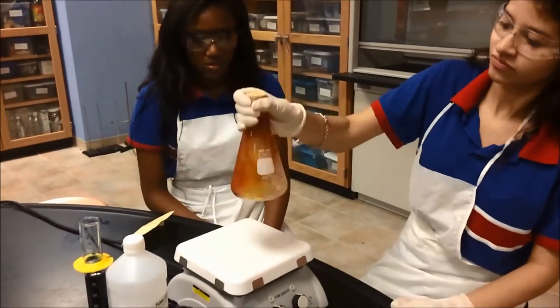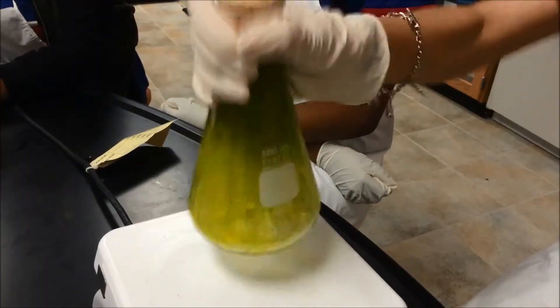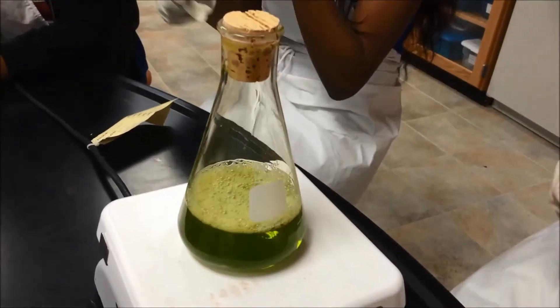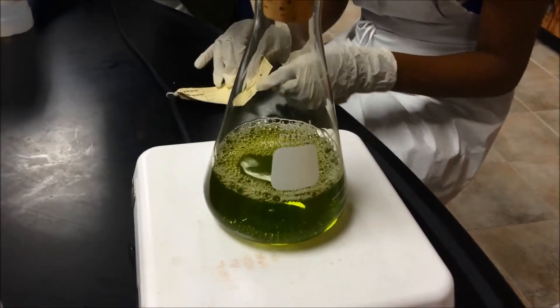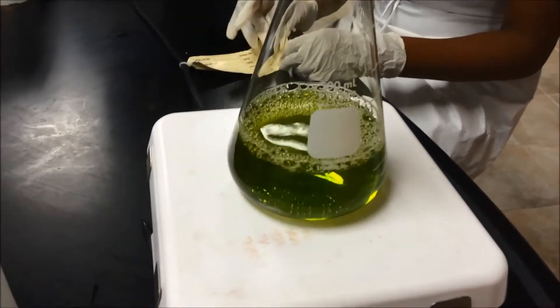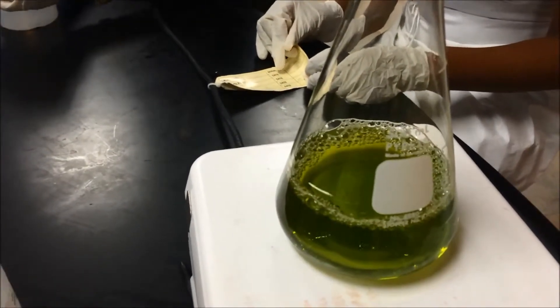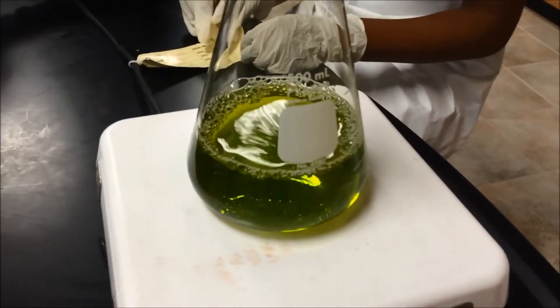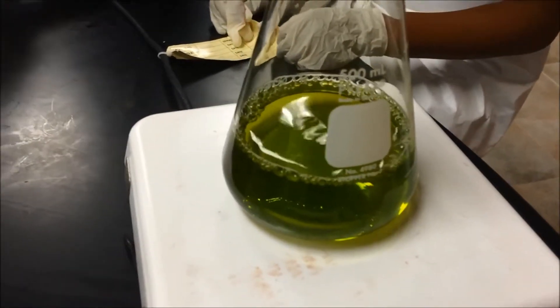Indigo carmine is an organic redox and acid-based indicator. It exists in different oxidation states having different colors. The reduced form of indigo carmine is yellow, while the fully oxidized form is blue. There is also an intermediate red form whose structure has not been fully determined. In this demonstration, the blue oxidized form of indigo carmine is first added to a solution of dextrose and sodium hydroxide. It immediately turns green due to the pH change.